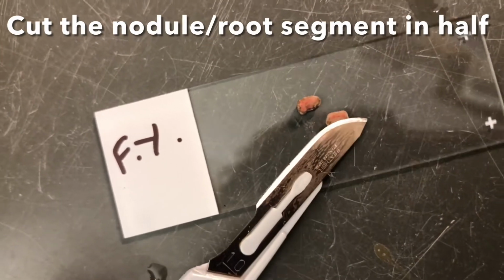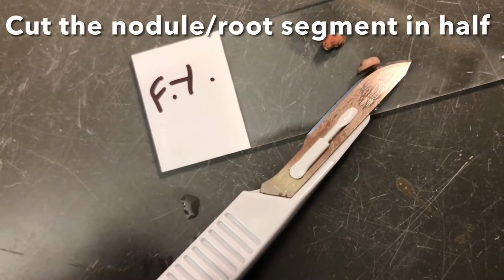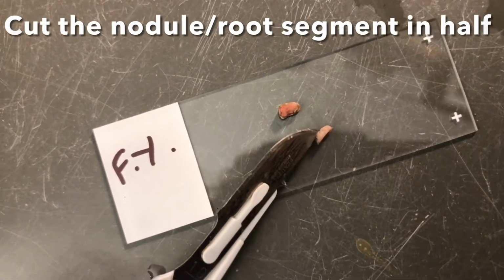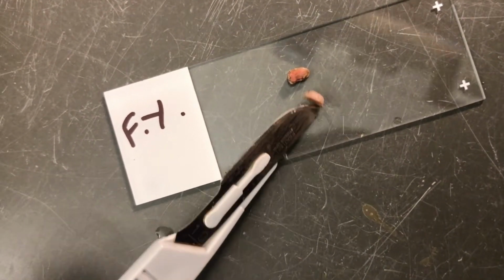Farmers actually do this with soybean. They go out and try to see if these nodules are fixing nitrogen. What they do is get a nodule, cut it in half, and look for this pink color.